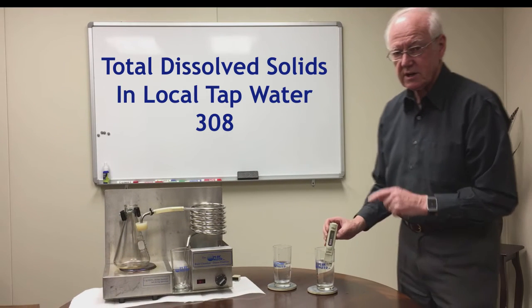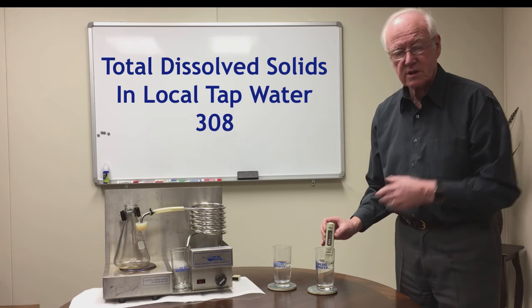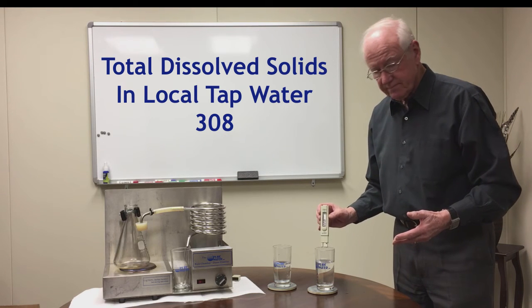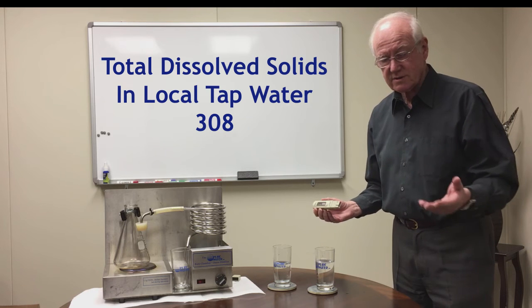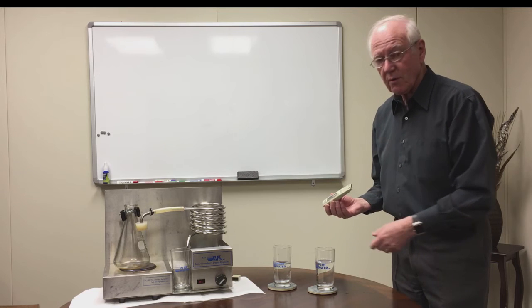This contains solids that are dissolved in the water that you can't see. You might ask me: what are these solids? They could be calcium, they could be magnesium, they could be lead — they could be a number of things that are in that water.